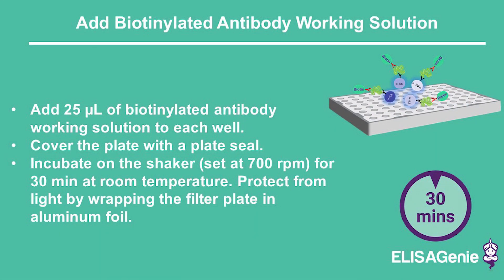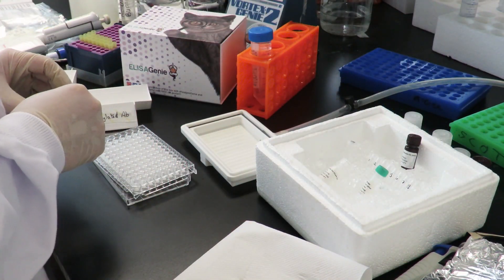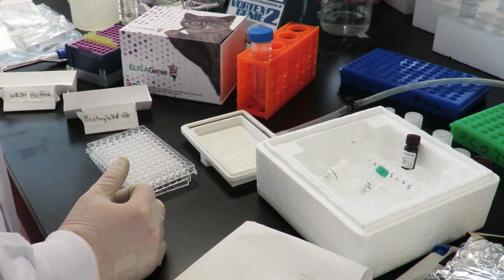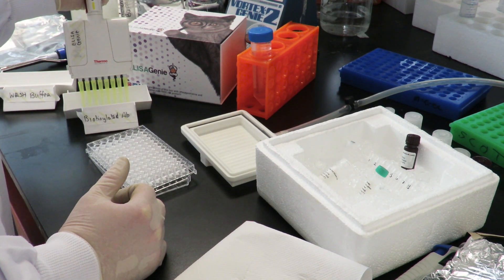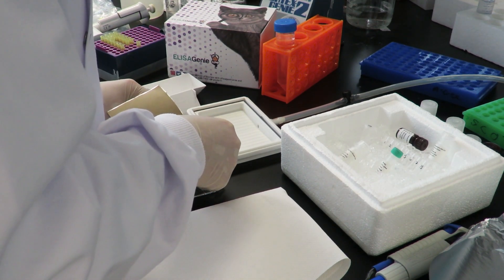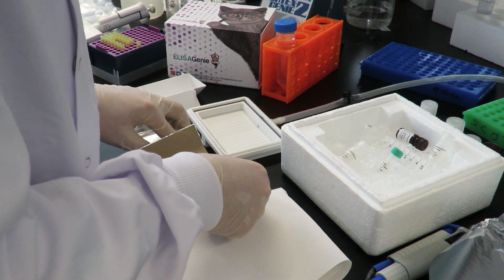Next, add 25 microlitres of biotinylated antibody working solution and cover the plate. Incubate for 30 minutes while shaking at room temperature.